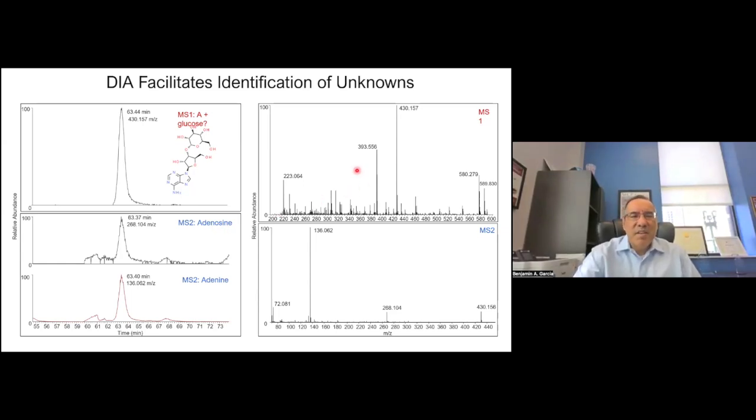Sometimes they've ended up being artifacts of the processing, but other times we're not exactly sure. This works by taking your full MS, lining up the peaks that come from the DIA or MS-MS, and then you can tell which ones correspond to which bases based on the peaks you see. In this case, it indicates a mass of 162, which would probably be some type of single sugar unit, like a glucose.